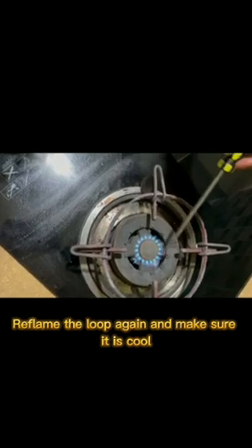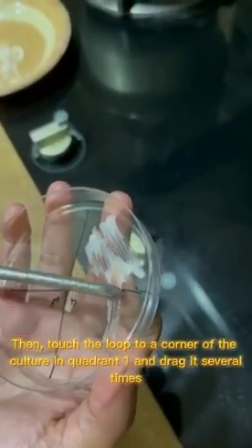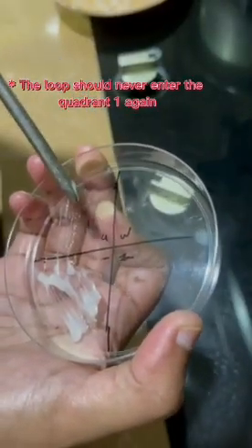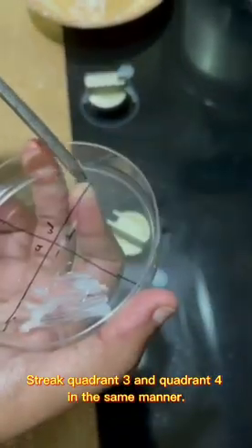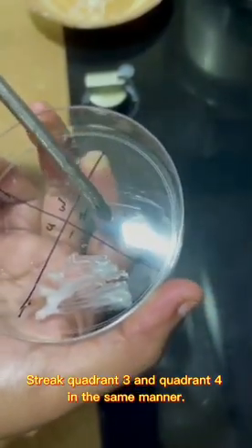Reflame the loop again and make sure it is cool. Then touch the loop to a corner of the culture in quadrant 1 and drag it several times to quadrant 2. Make sure the loop should never enter quadrant 1 again. Then streak quadrant 3 and quadrant 4 in the same manner as quadrant 2.